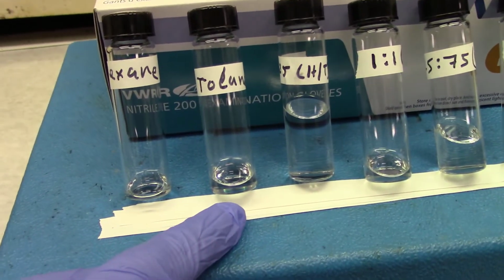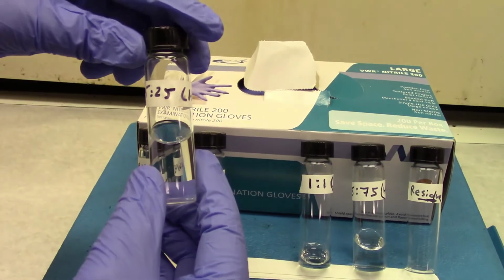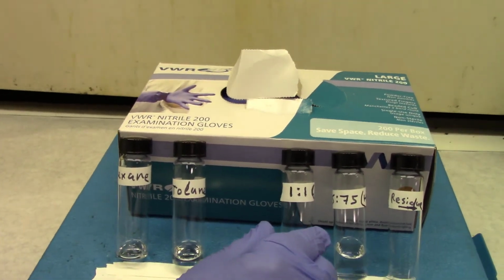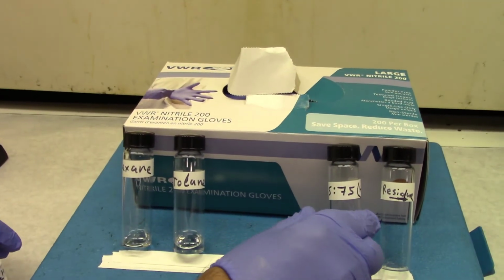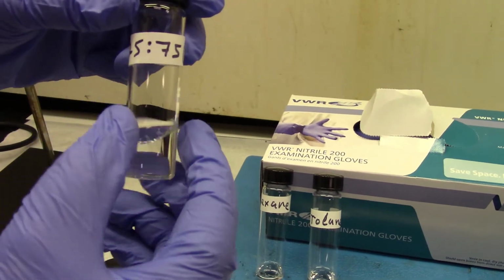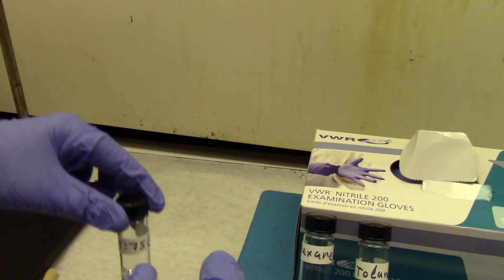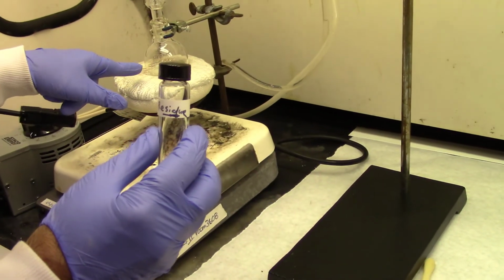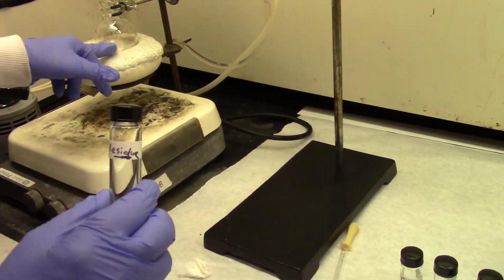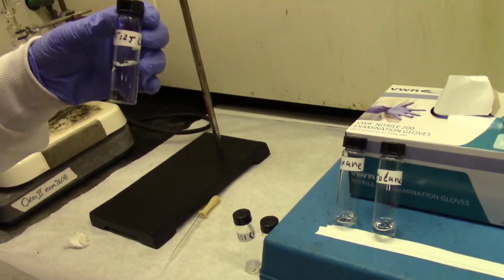I want to make a standard curve. For that, I have pure toluene, pure hexane, and this is 75% hexane, 25% toluene, and this is 50-50 hexane and toluene, and this is 25% hexane and 75% toluene. These are three solutions that we have made to make sure that we have a standard curve. We are going to measure the refractive indices of all these, and we will also be measuring the refractive indices of the three fractions that I have collected.